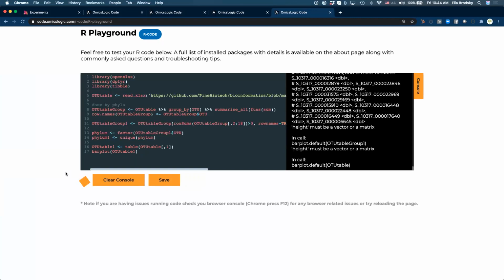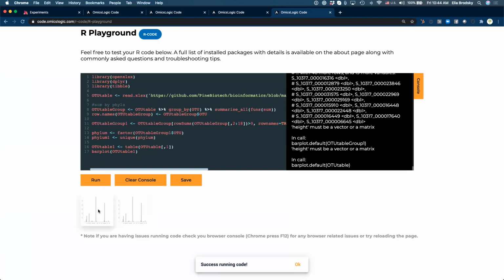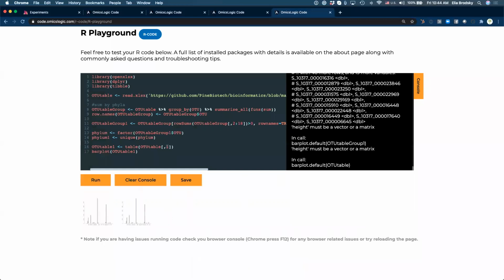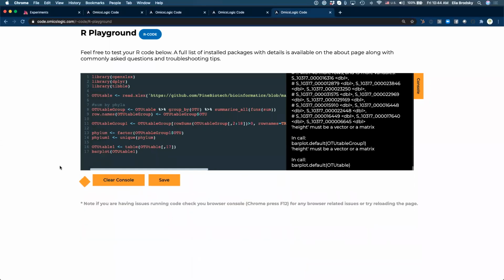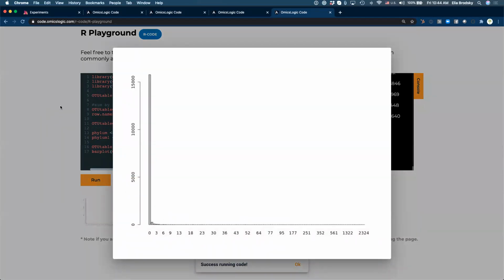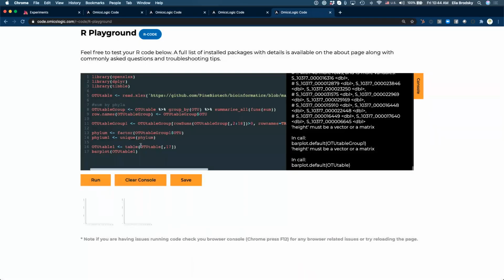So if we just do a table of 1, this will give us 1 sample. If I want to do, let's say, number 17, I can get number 17, and so forth. But what I need to keep in mind is that I need to store my information about the phyla. So this is for 1 sample, we already did this. So let's now take for all samples.